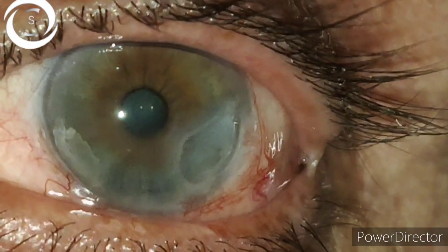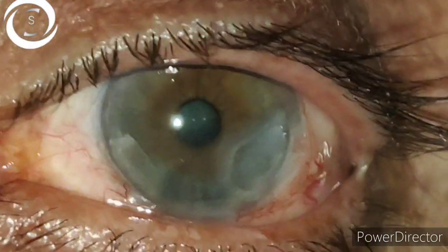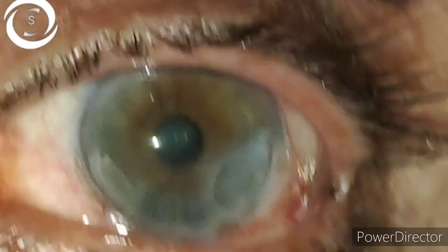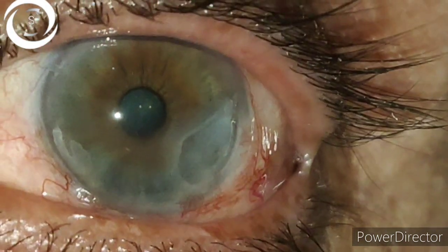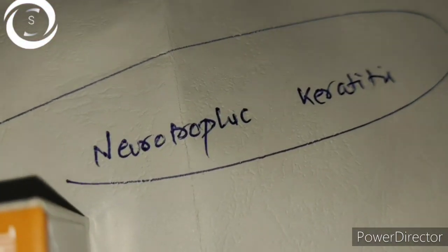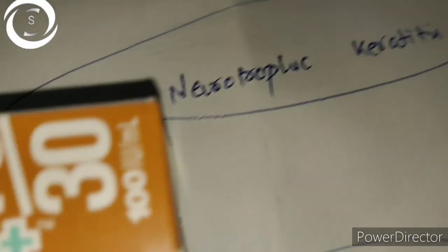Now today's video is about how to prepare insulin eye drops for topical use in neurotrophic keratopathy with persistent epithelial defects in non-healing ulcers. Now as you know, ready-made insulin eye drops are not available commercially anywhere, so you need to prepare it from an insulin vial.